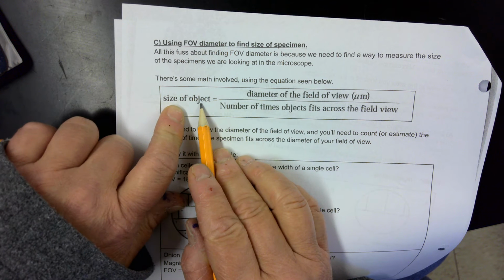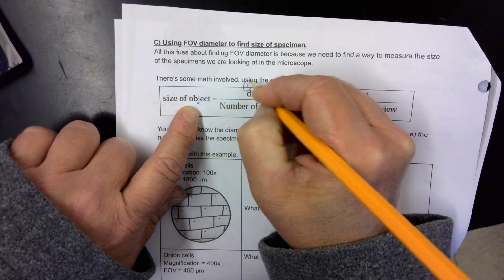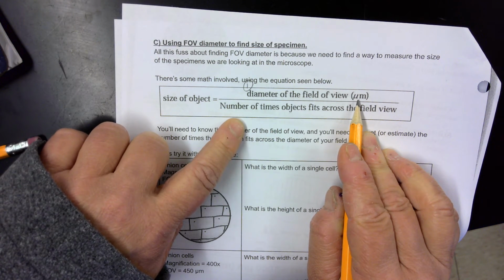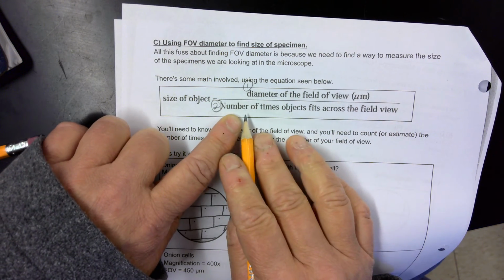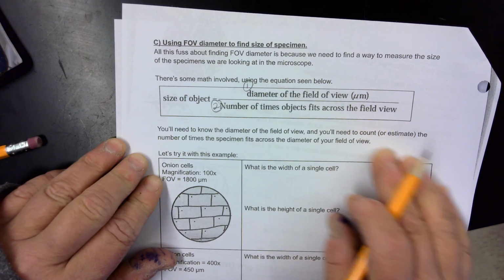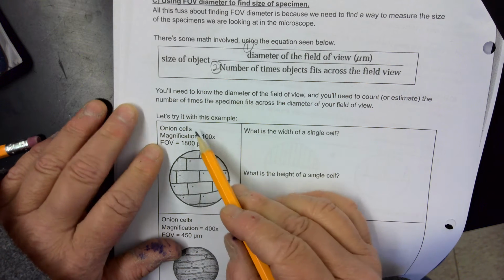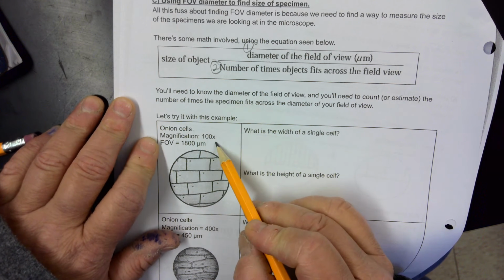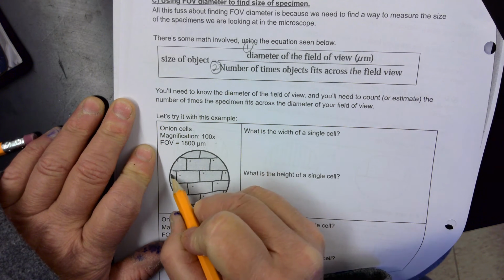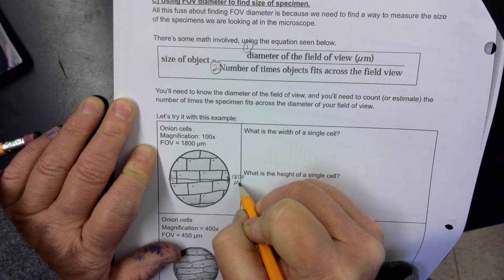In order to find the size of the object that you are looking at, you need to know two things. You need to know the diameter of the field of view, which we just spent some time figuring out how we got that information. And number two, you're going to need to count the number of times the object fits across that field of view. We're going to divide those two numbers. Okay. So once we have those, we can do the math. So let's try it with this example right here. We've got onion cells. The magnification is 100x. And our field of view is 1800 micrometers. So that means the distance across the diameter is 1800 micrometers.